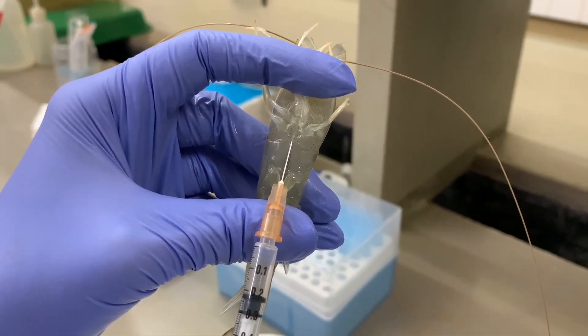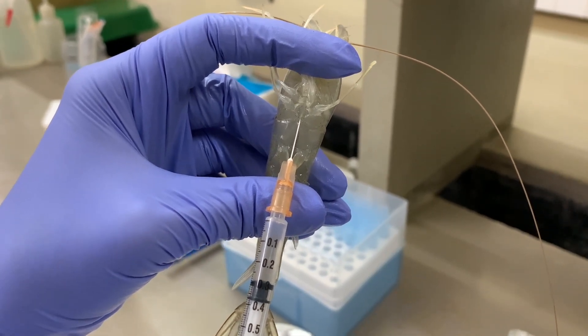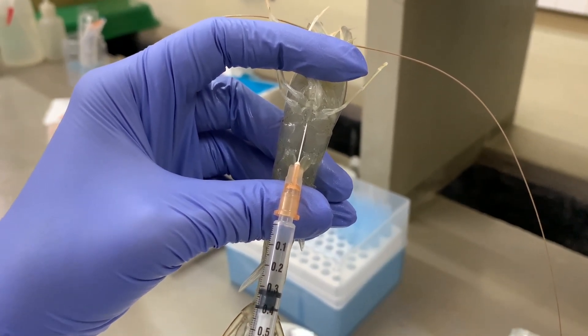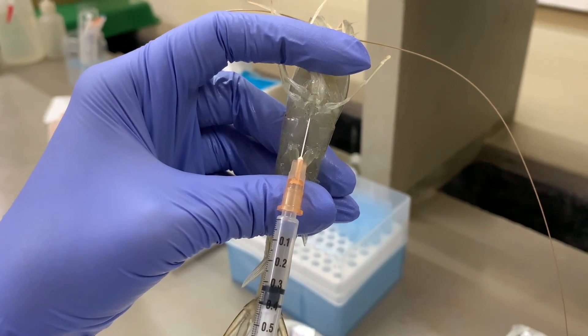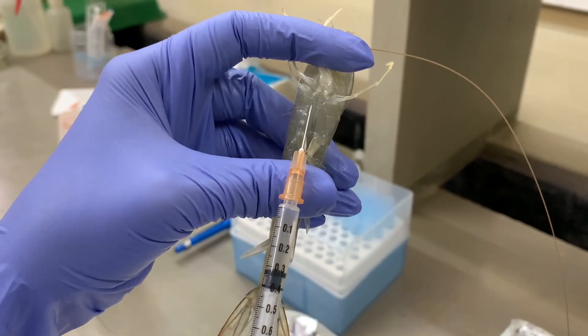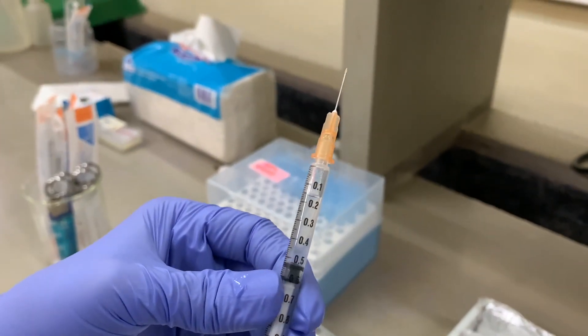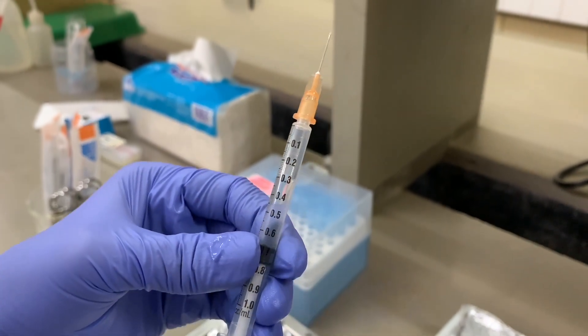Position the shrimp with the ventral side facing towards you. Position the syringe on the ventral sinus of the shrimp and draw 100 microliters of hemolymph slowly. After extraction, mix the hemolymph evenly with the anticoagulant to prevent it from clotting.